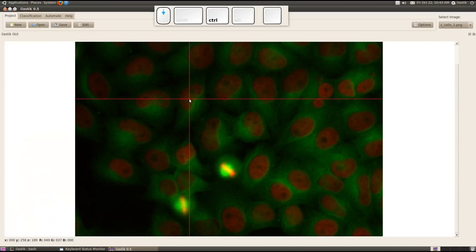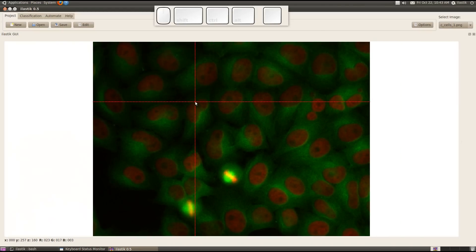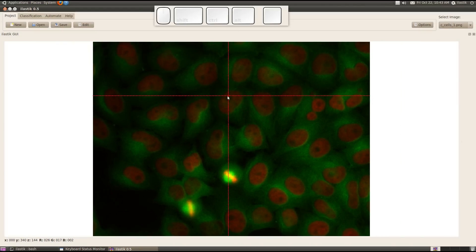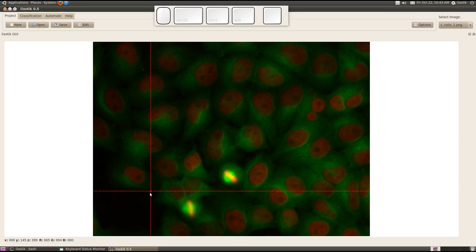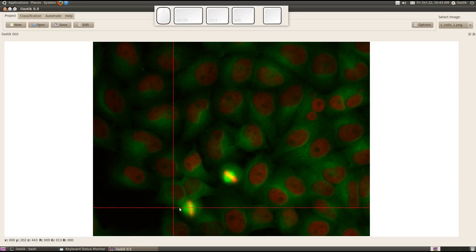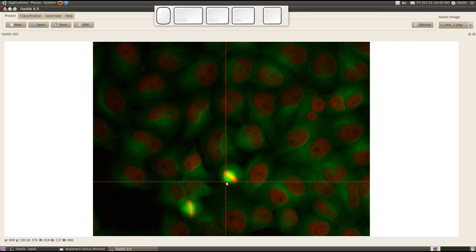So what we see here are cell nuclei in red. In green there is cell cytoplasm. We also have background and a special phenotype over here, which is a mitotic cell.